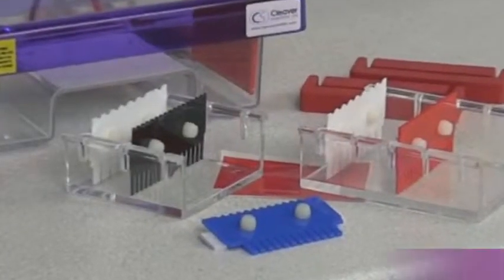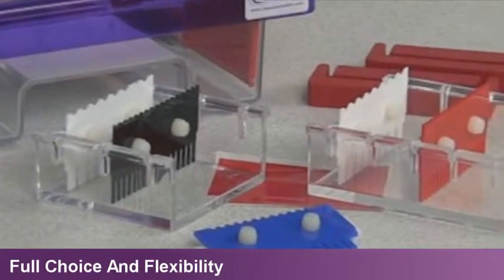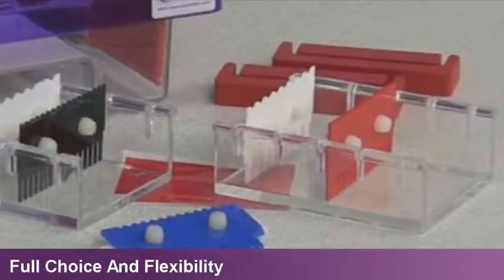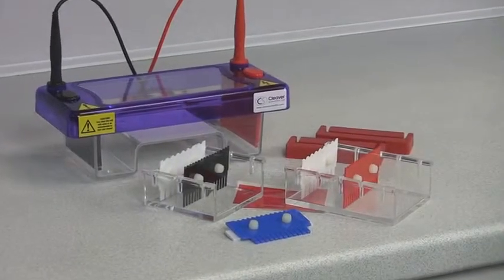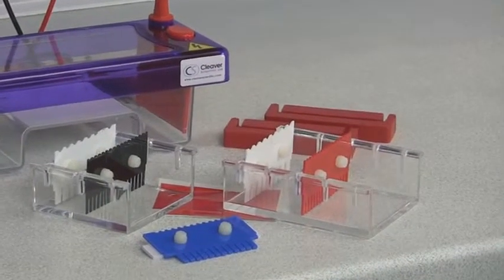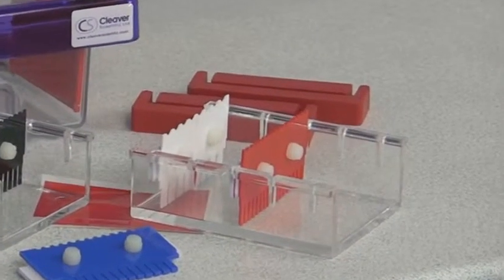We offer more gel trays and combs than any other electrophoresis gel tank manufacturer. At least two combs are supplied as standard with each multi-sub unit. Two removable UV transparent gel trays eliminate the need for additional gel tanks or changes in application, saving bench space, time and money.